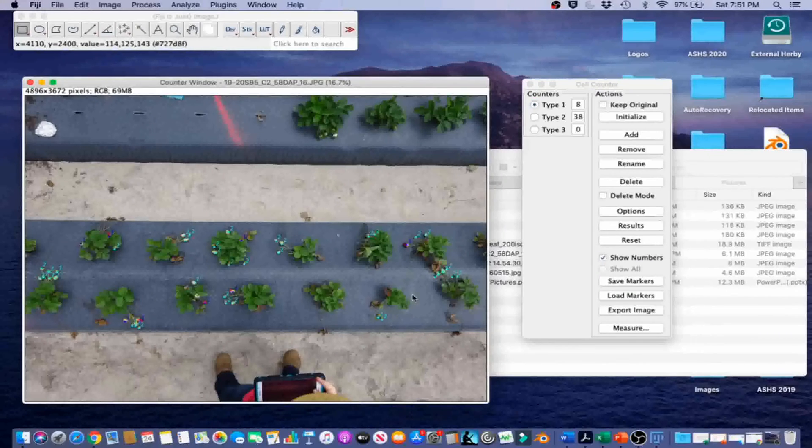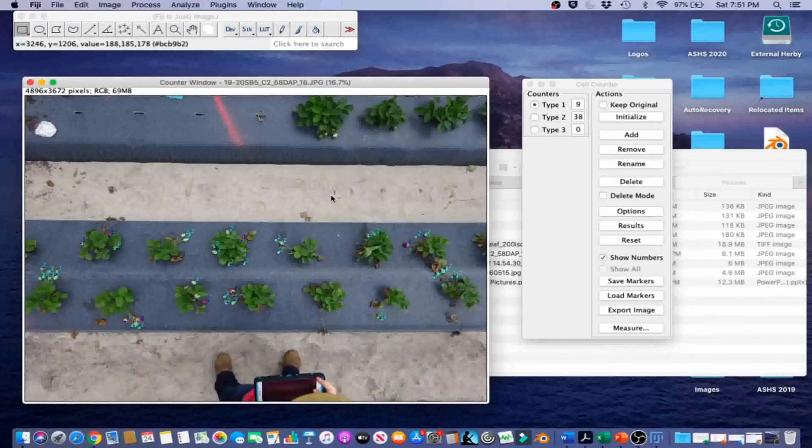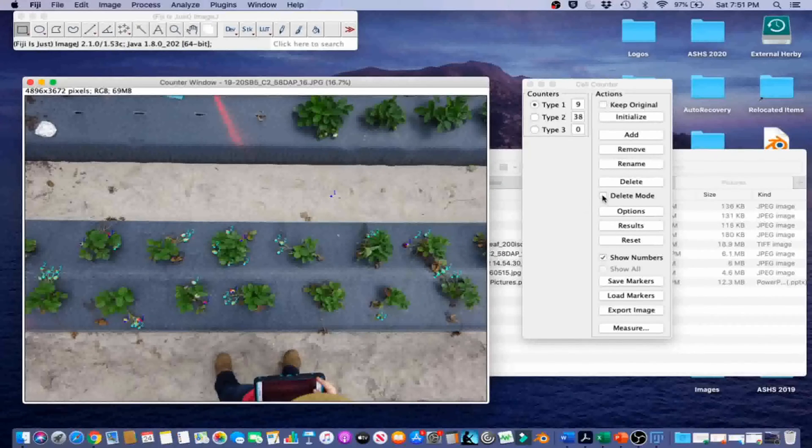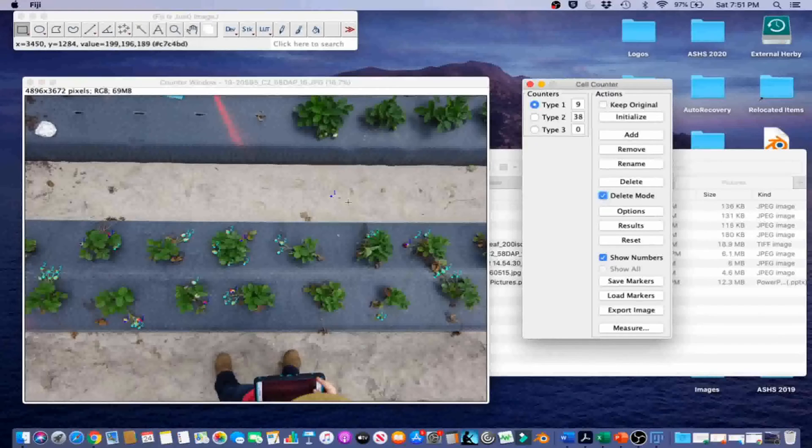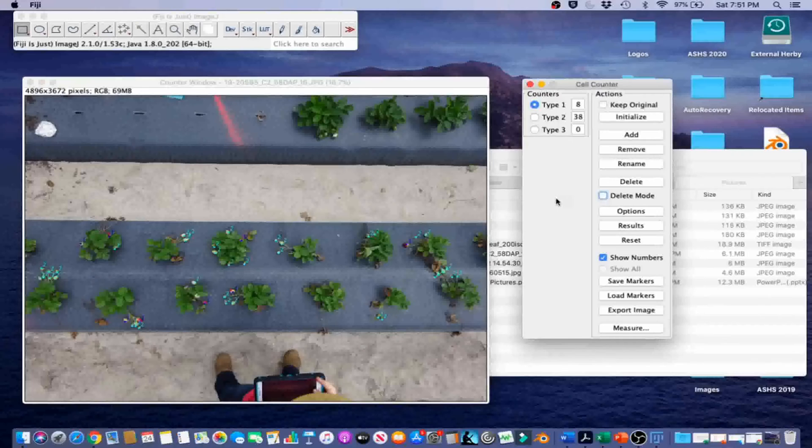Now, if I make a selection where it's just obviously an inappropriate selection, like right over here, I can go ahead and go on to Delete Mode, and then click it, and it will delete it, and then uncheck the Delete Mode to go back to normal again.